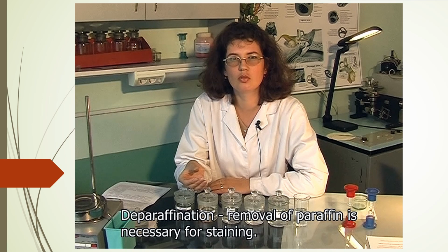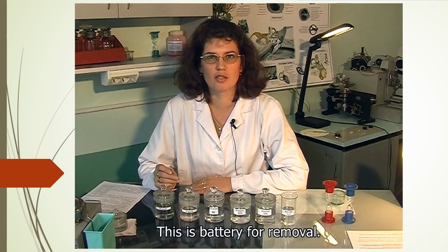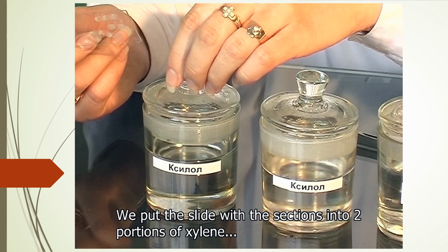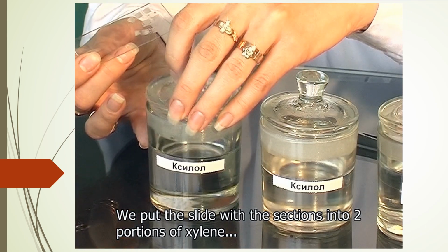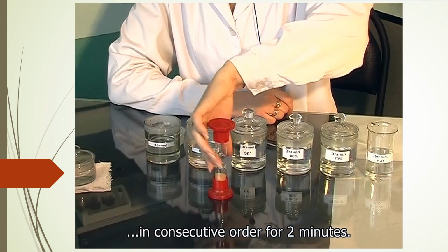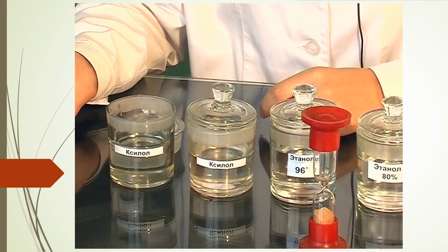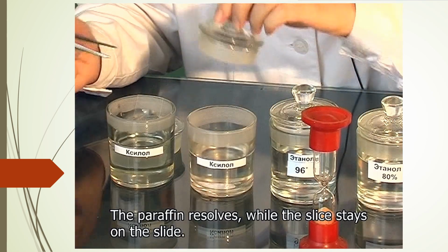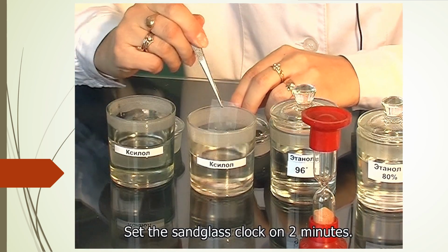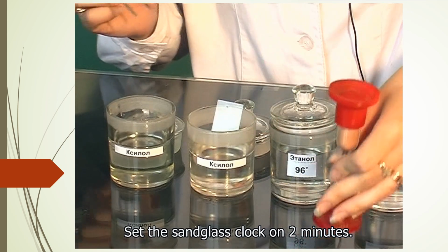Deparaffination. Removal of paraffin is necessary for staining. This is the battery for removal. Xylene removes the paraffin. We put the slide with the sections into 2 portions of xylene in consecutive order for 2 minutes. The paraffin dissolves, while the slice stays on the slide. Set the sandglass clock to 2 minutes.